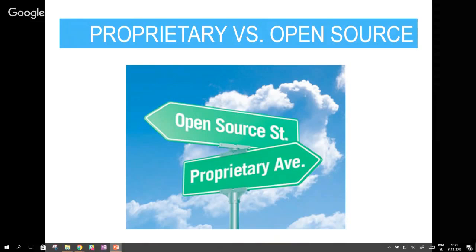So we want to give the freedom to the scientists that they can do the connection and that they are not vendor dependent. What I mean by that is that when you decide which instruments to buy, you don't have to buy the instruments from the same vendor, but you will be guaranteed that once you buy an instrument, you'll be able to plug it into the whole system, the whole network, and everything will work. So this is where I personally believe ELNs will play a big role in the future, automating our lab and making it smart.